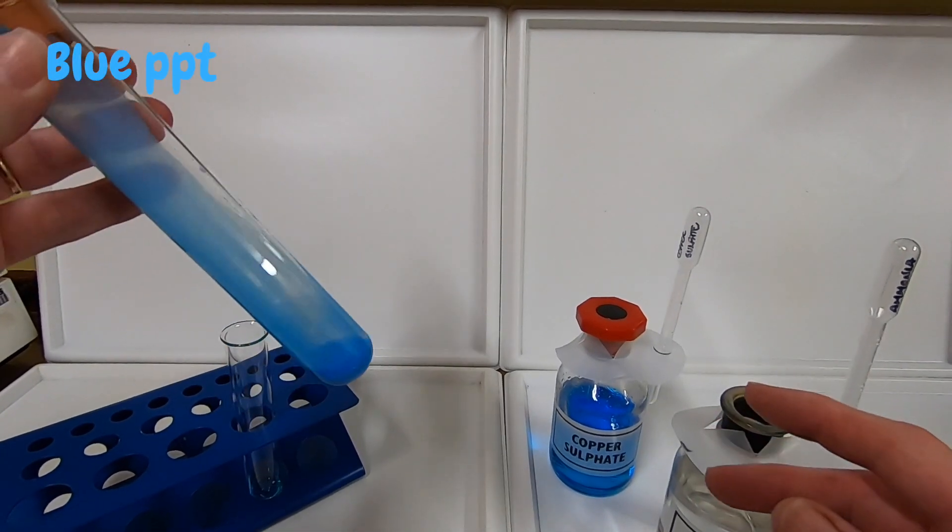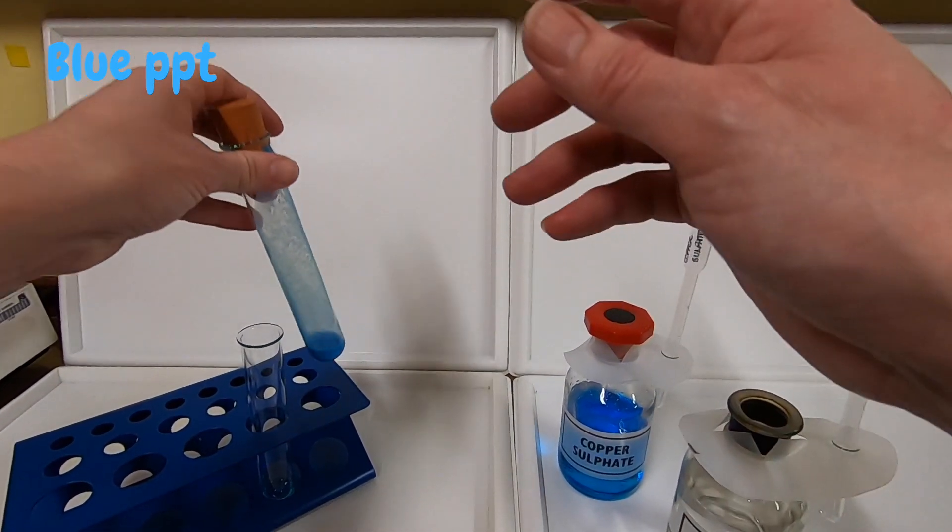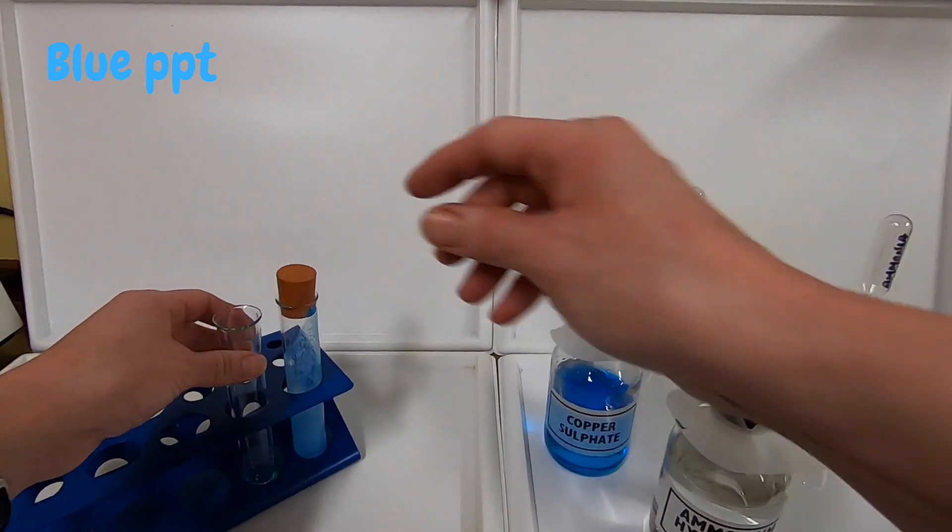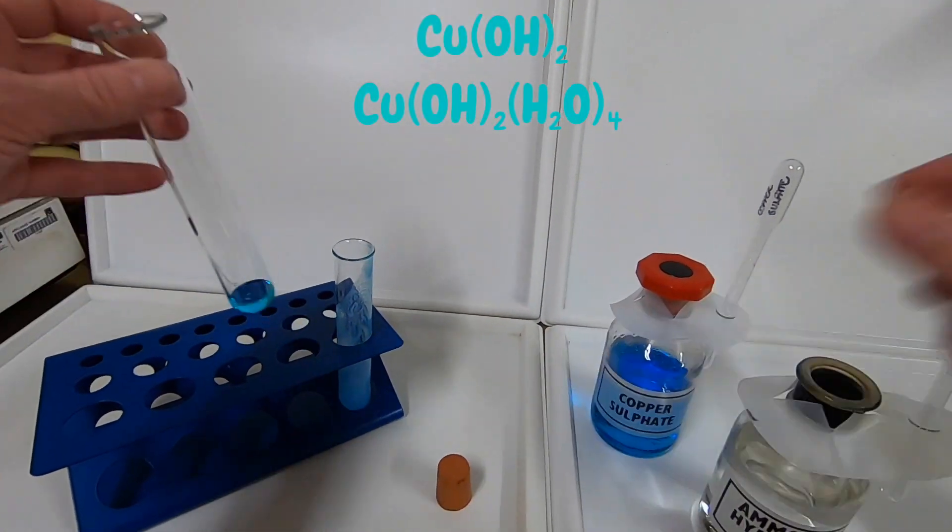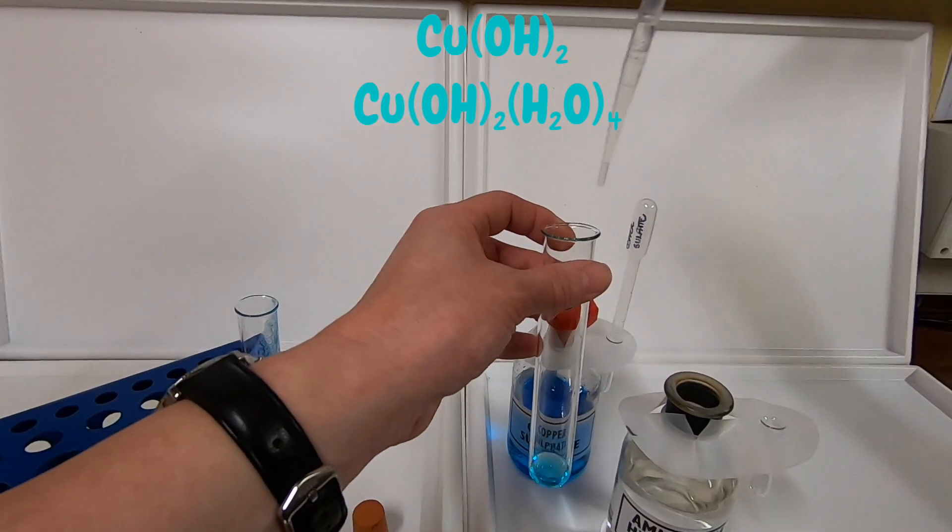You can see that a blue precipitate has formed. This is a solid that forms when two solutions are mixed. In this case, it is copper hydroxide. The copper hydroxide is insoluble, so it forms as a solid.